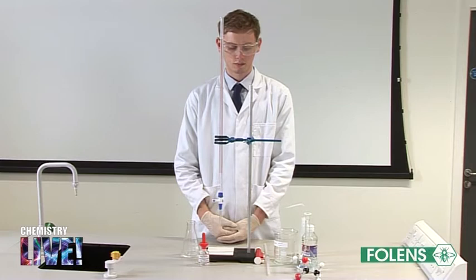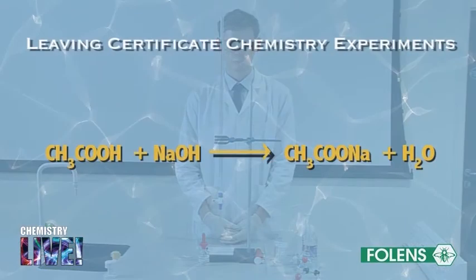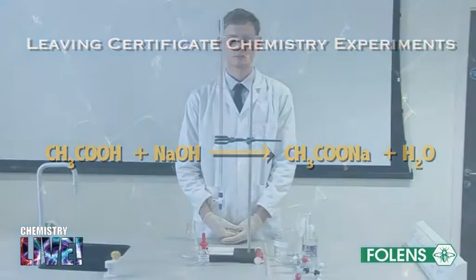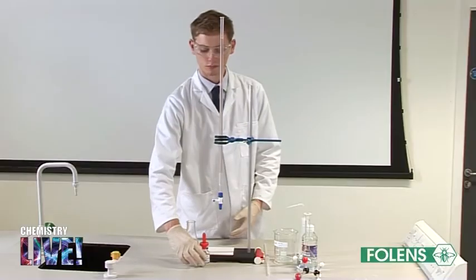The amount of ethanoic acid in vinegar can be determined by titrating the vinegar against a standard sodium hydroxide solution. The equation for the reaction is shown on the screen. We will use phenolphthalein indicator to detect the endpoint in this titration.